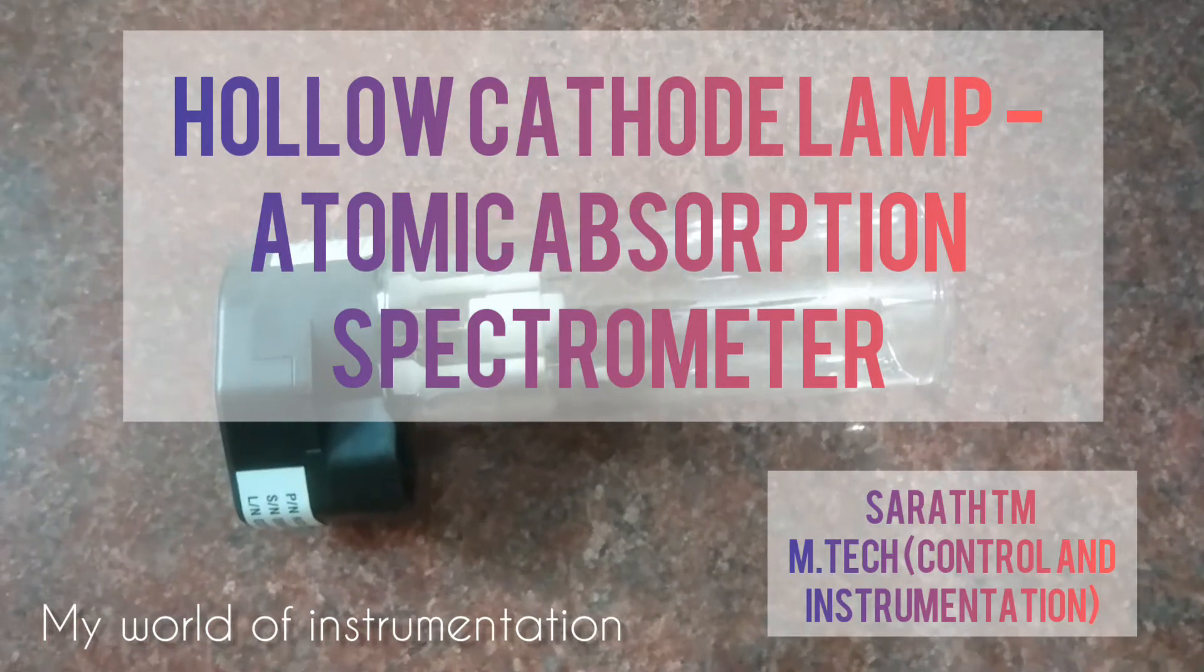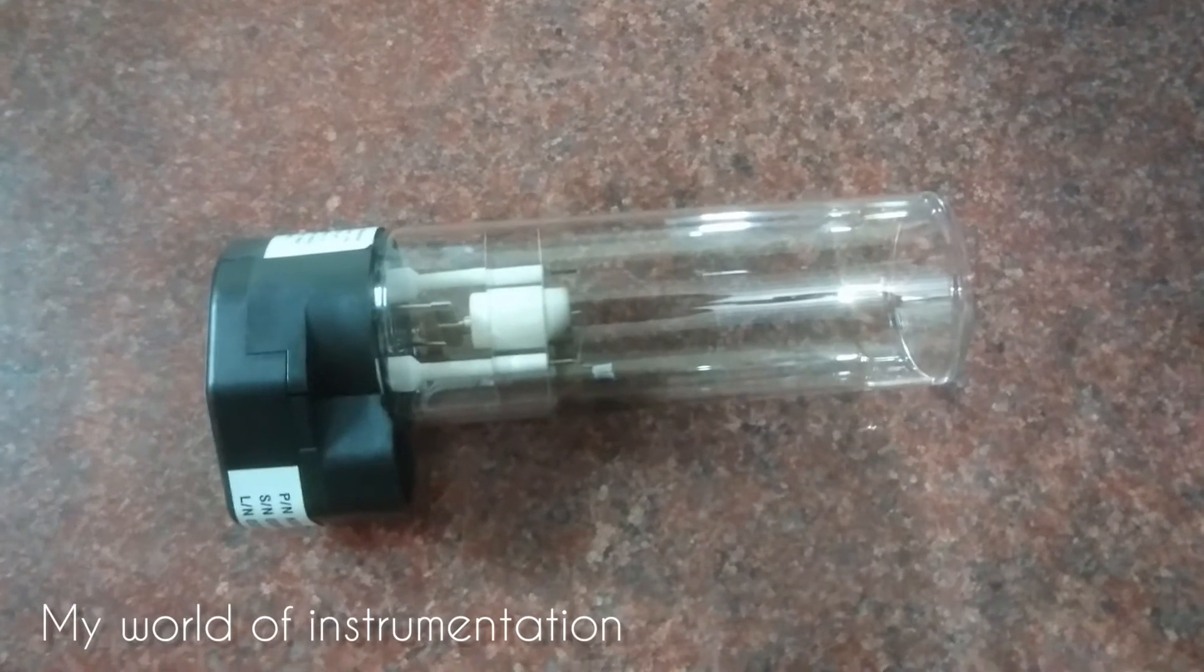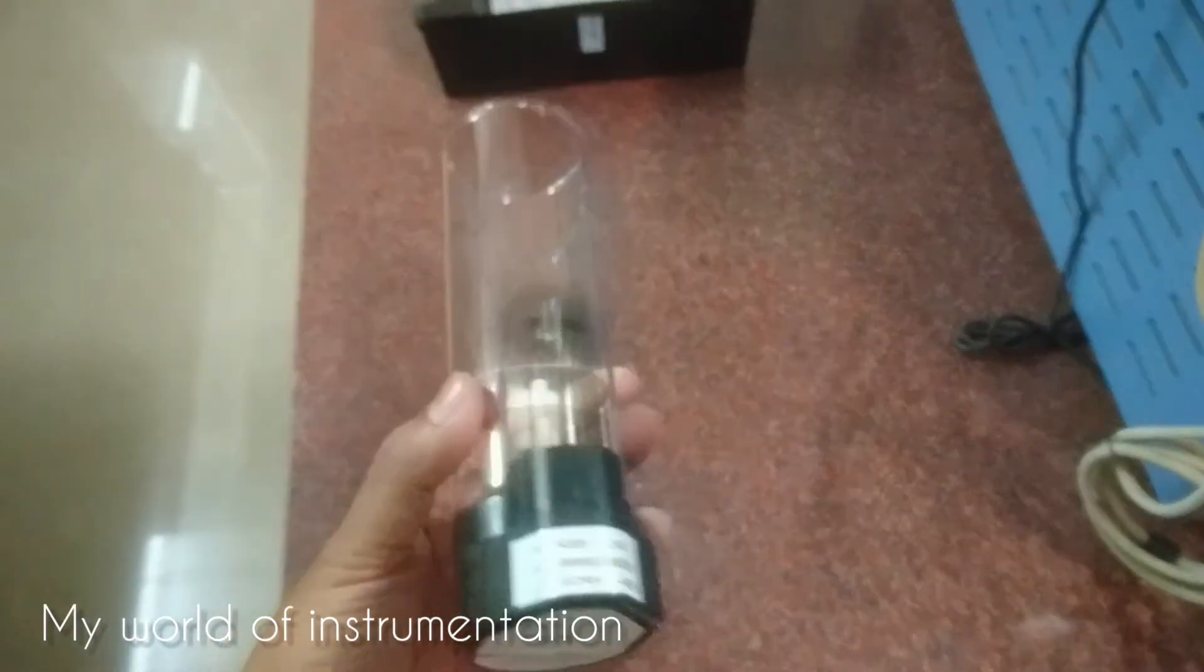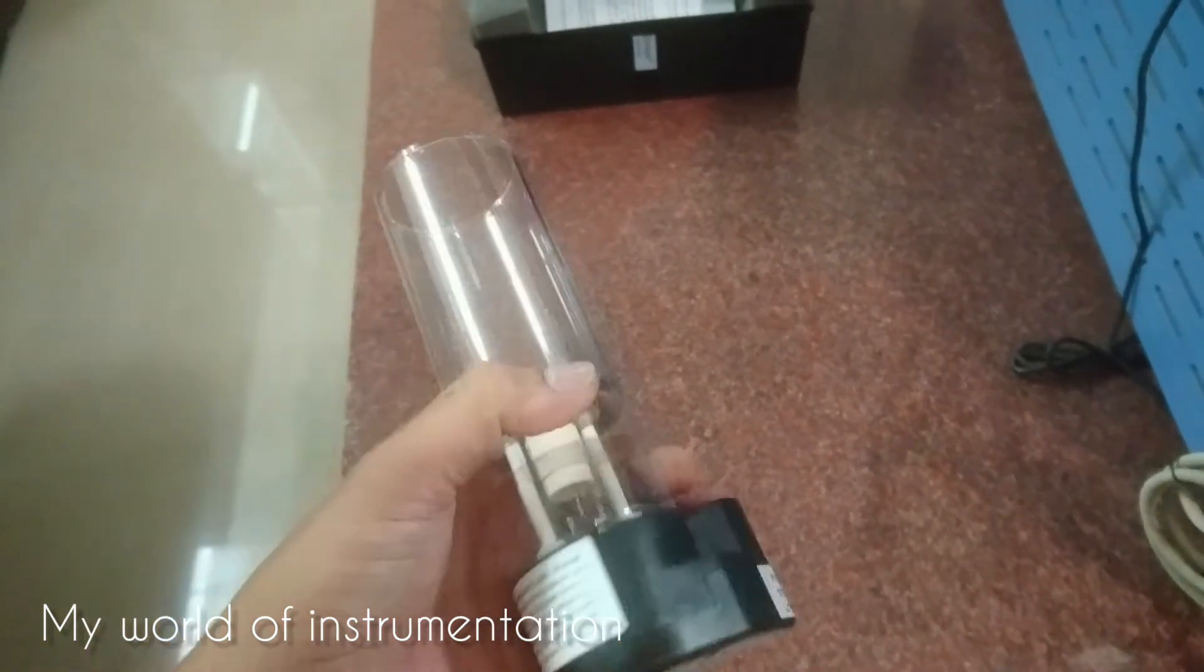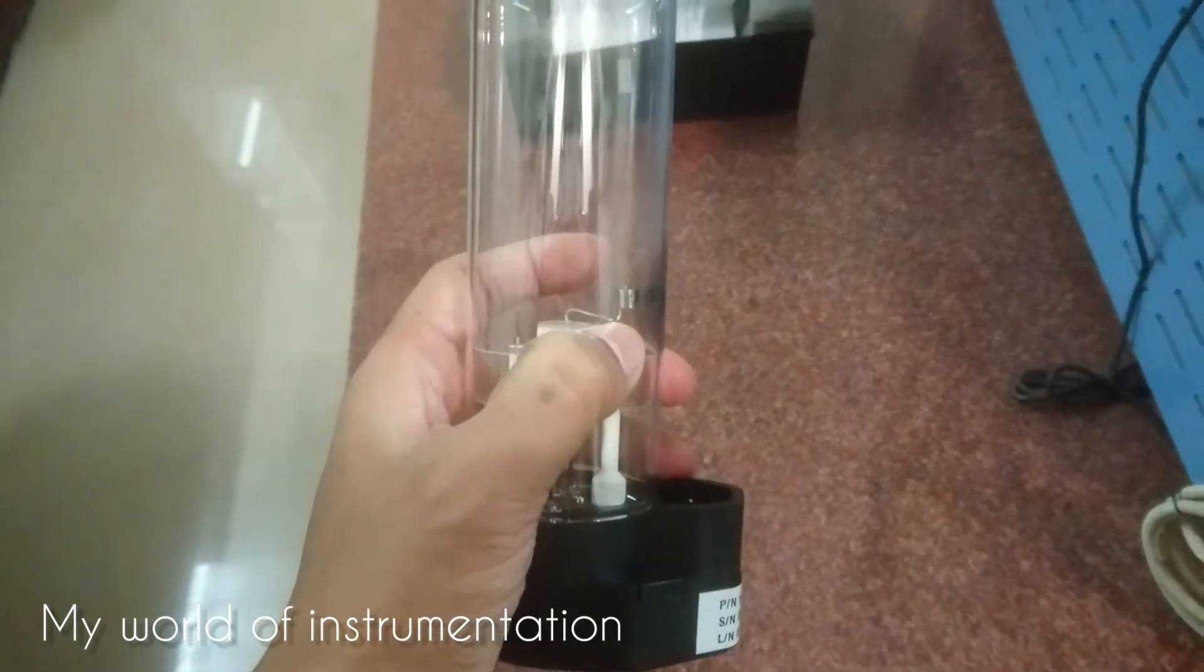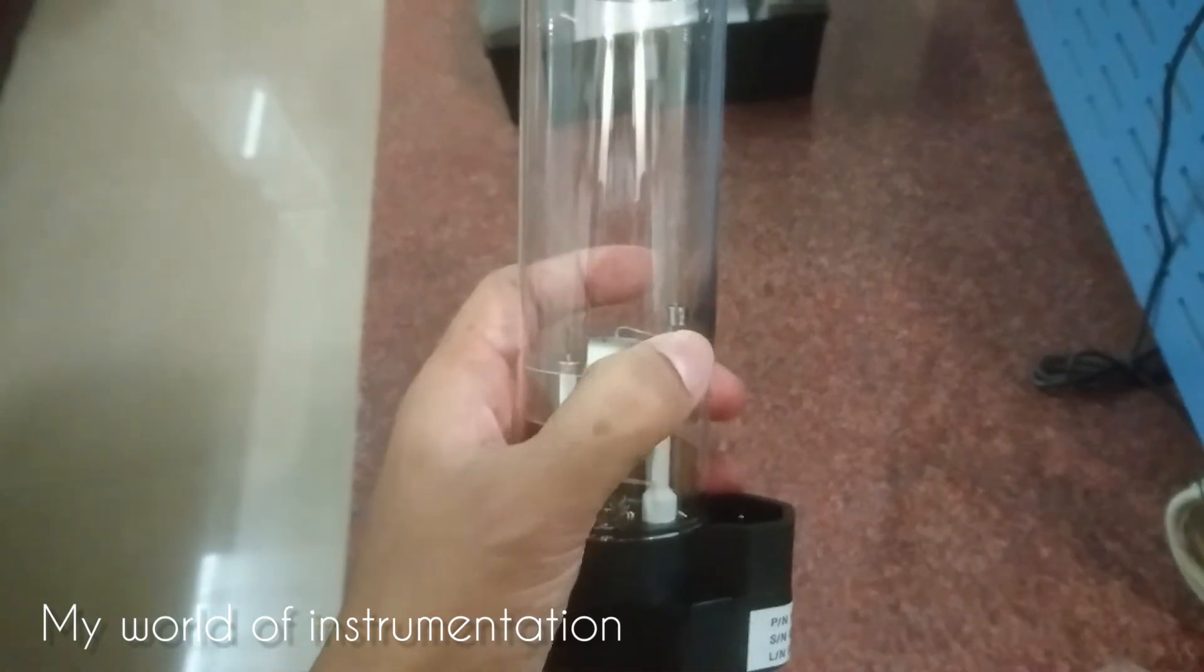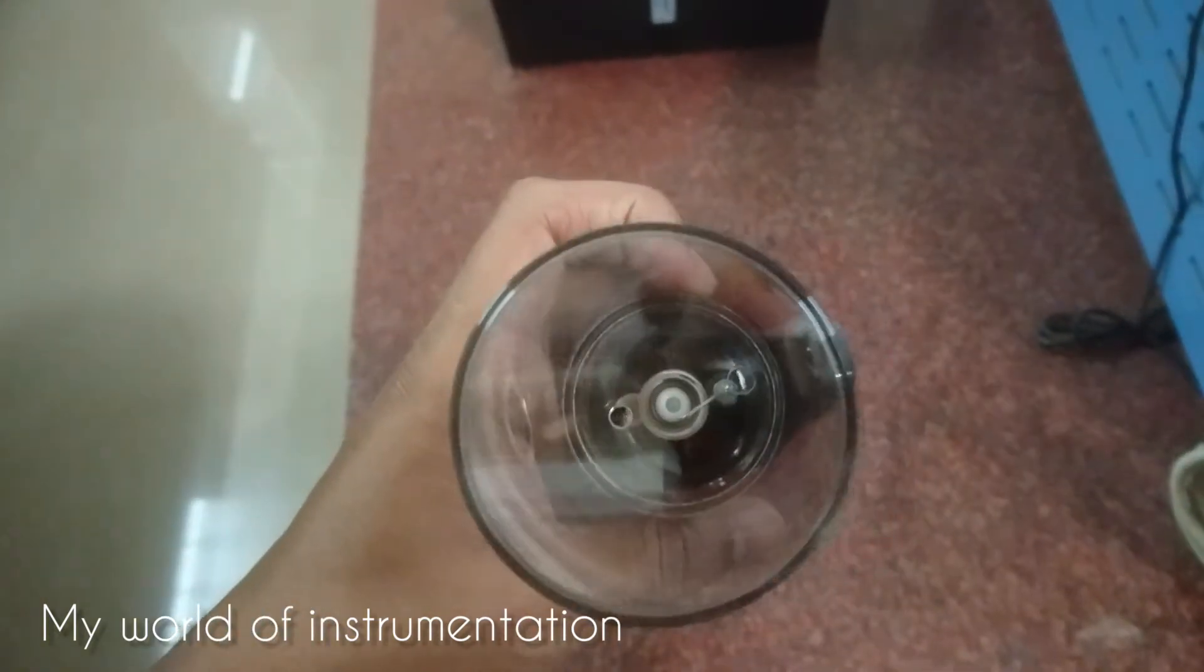Hi, in this video we are going to see the hollow cathode lamp used in atomic absorption spectrometer as a radiation source. This is a hollow cathode lamp for element magnesium, and in this hollow cathode lamp there is a tungsten anode and a cylindrical hollow cathode.